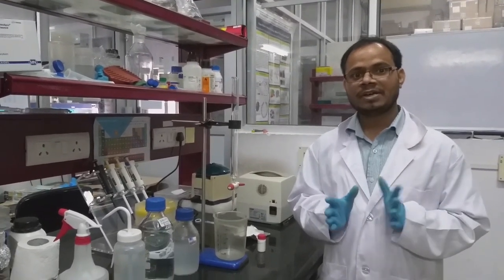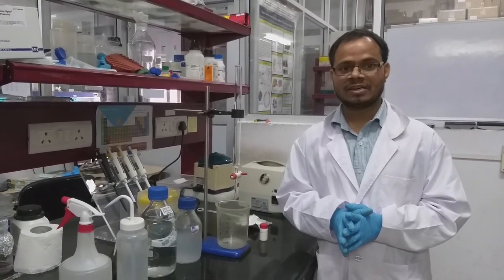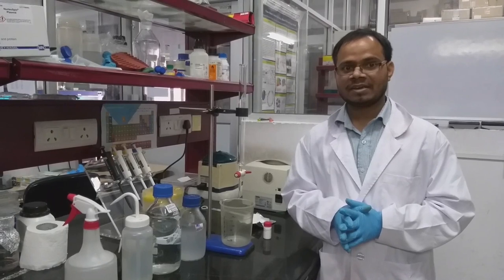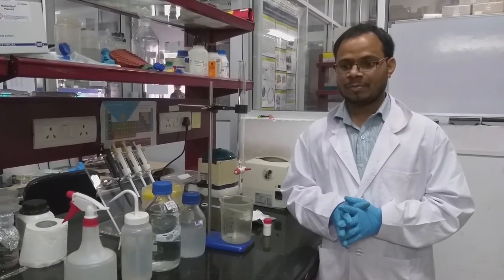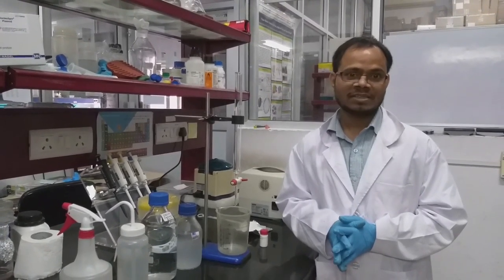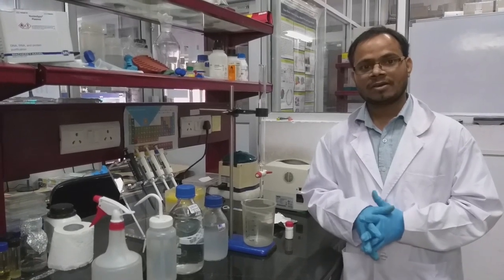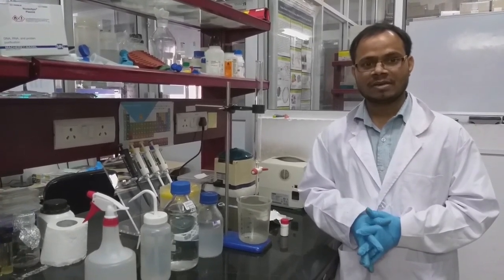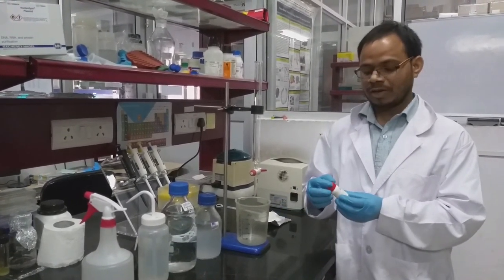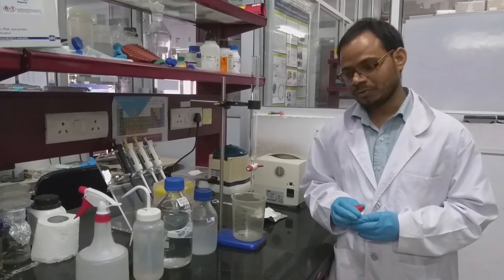What is gel filtration chromatography? There are two phases in this process. One is the stationary phase, another one is the mobile phase. The stationary phase is mainly a matrix, a cross-linked matrix. For example, we can use dextran, another name of which is Sephadex. This is highly cross-linked glucose molecules. Or we can use agarose, this is also cross-linked, or we can use polyacrylamides. But in this video we are showing Sephadex G75. This is the stationary phase we are using.